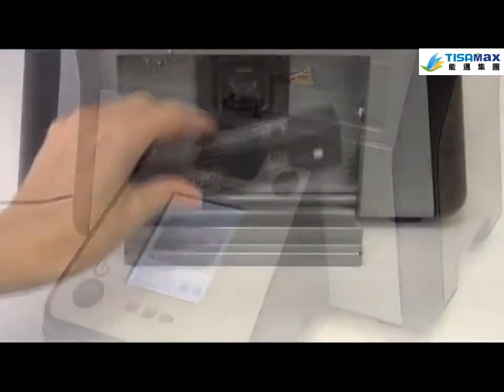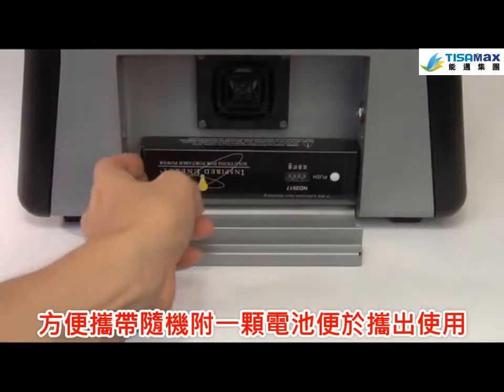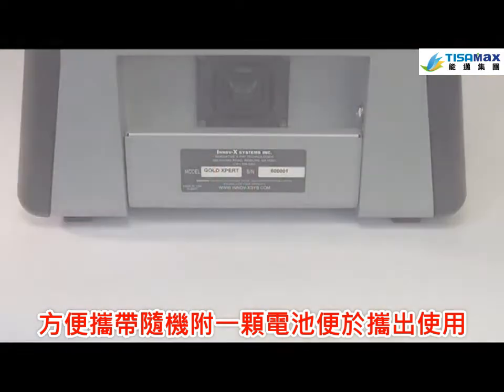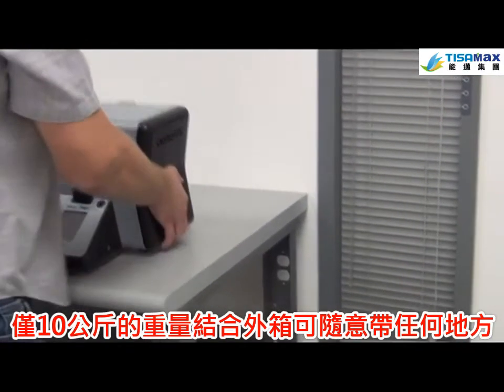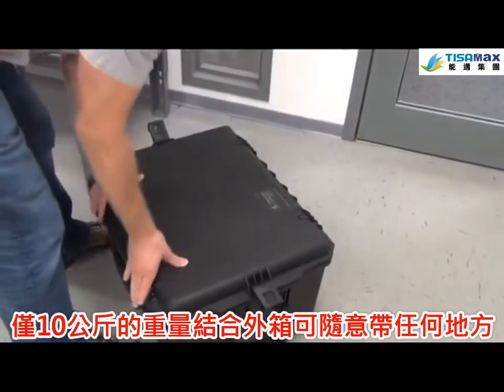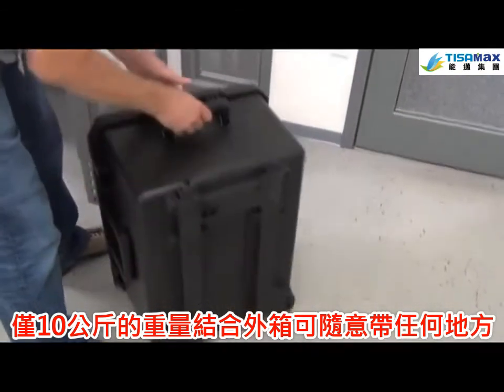The Gold Expert offers the convenience of portability as well. An optional battery pack allows testing on the go. The Gold Expert weighs only 22 pounds or 10 kilos and, combined with its custom carrying case, can go anywhere you need it to.